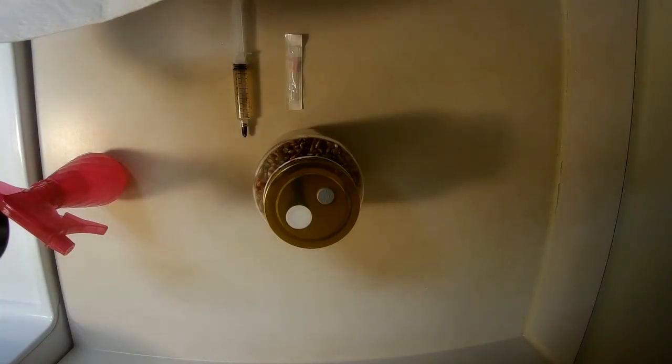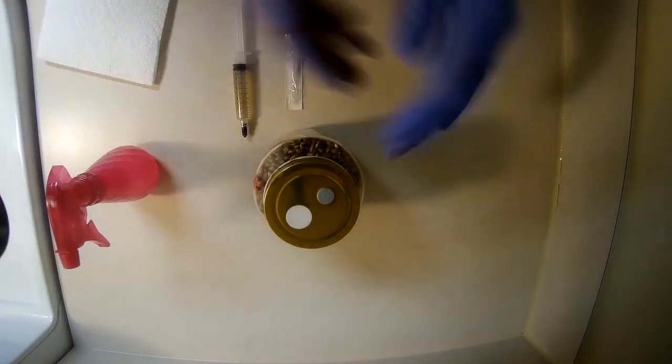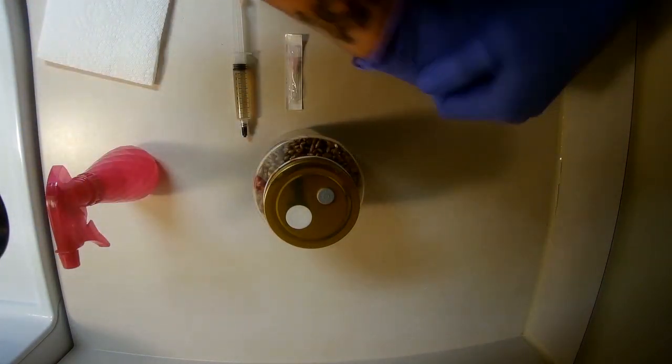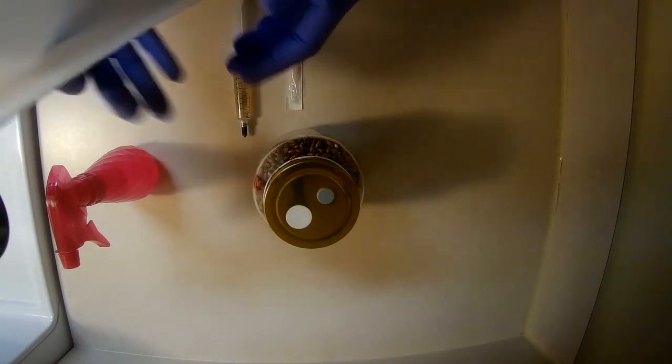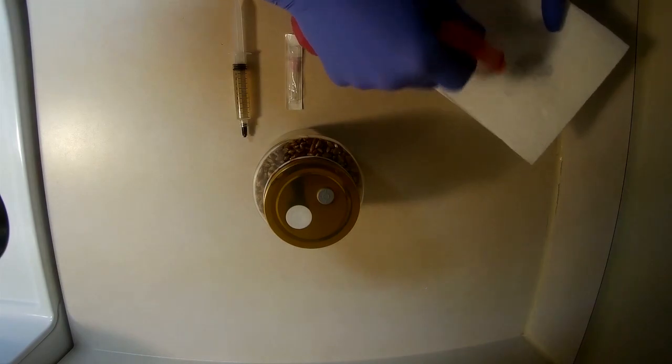Once I've got my area completely sanitized, I want to make sure that I sanitize my hands thoroughly to avoid any contamination whatsoever. Then we're also going to make sure we sanitize our jar thoroughly.